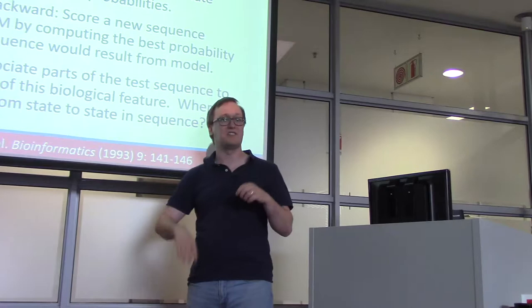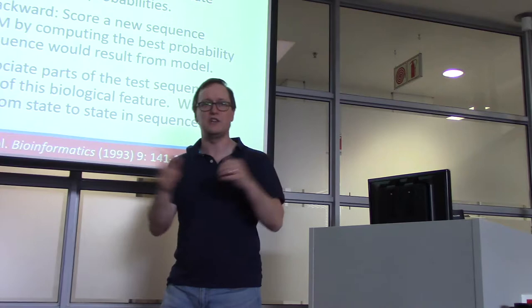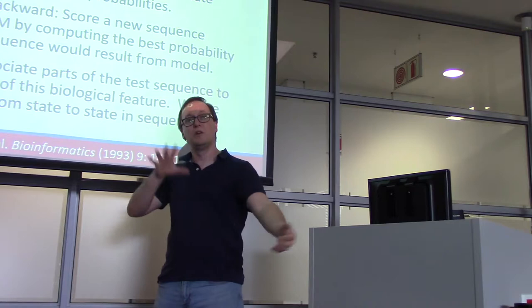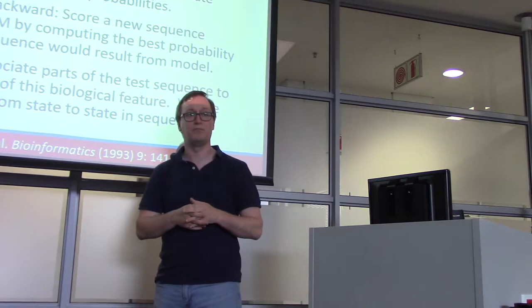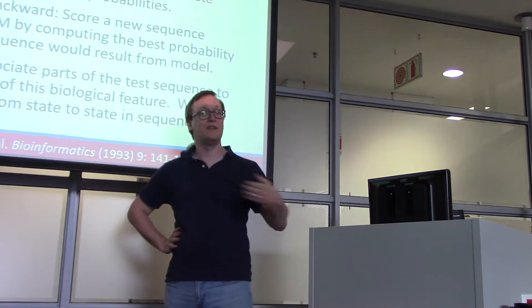So maybe we know about 500 sequences for this species, 500 proteins. We know where to find their genes in that genome. So we could point to these different sequences, split them up into the parts that we know to be promoters, parts that we know to be introns, parts that we know to be exons, and then the software will construct the hidden Markov model for us from these sequences that we've marked in this way. But that's not where we want to stop. By creating the hidden Markov model, we are giving ourselves the ability to find more gene structures that follow the same rules in this genome.